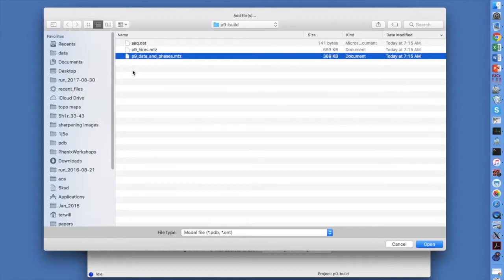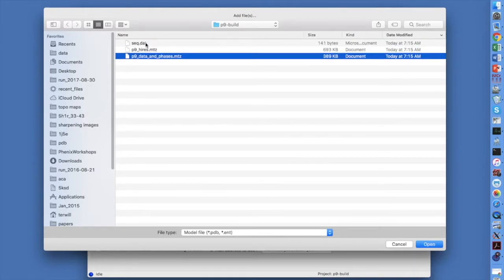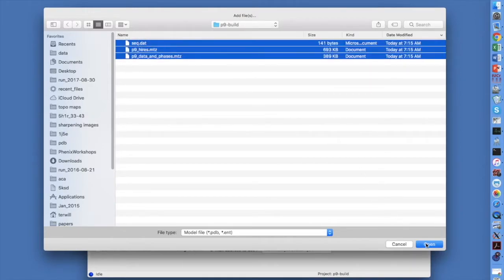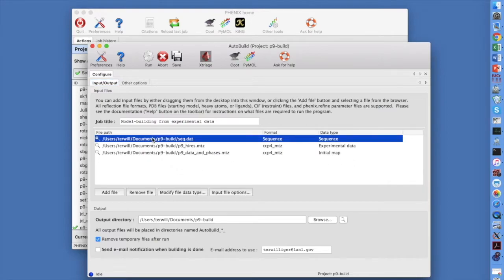P9DataandPhases.mtz contains low resolution measured data and experimental phases. P9HiRes.mtz has high resolution data. Click Open to load the files. Now let's tell the GUI what these files contain. The GUI correctly guessed the Seek.dat is a sequence file.